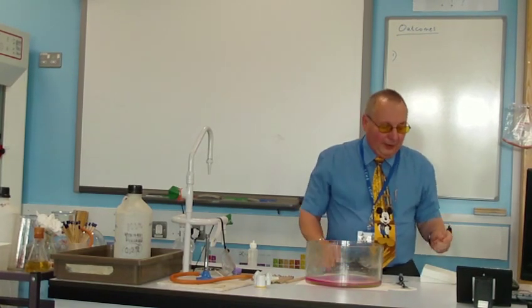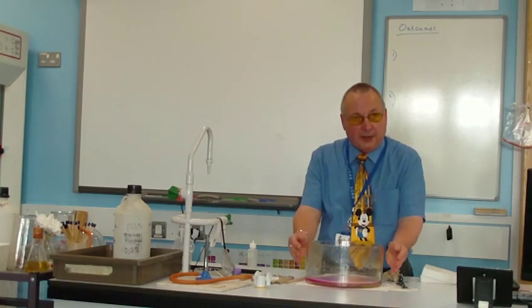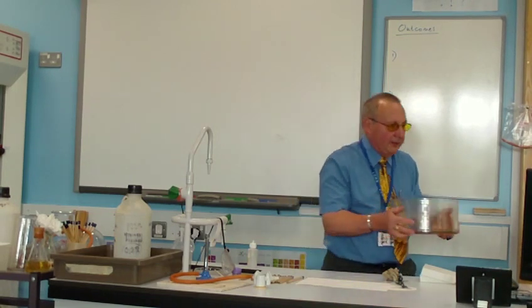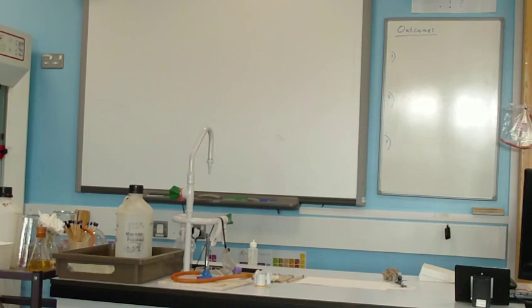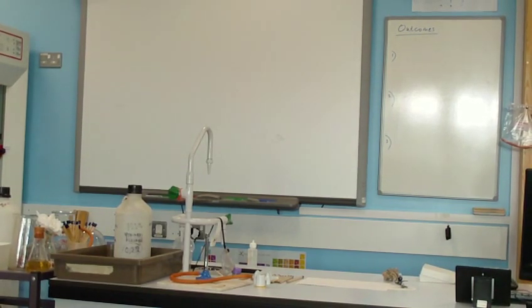Now, what did I say that gas was? It wasn't the metal that was lighting. It was the gas that it produced with water that was lighting, and the gas begins with H. Can you think of a gas that begins with H? You put it in weather balloons to send them up into the air. It's a lot less dense than air.